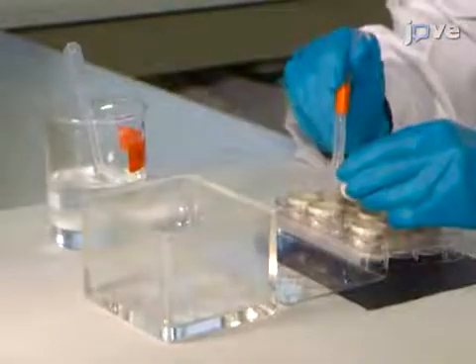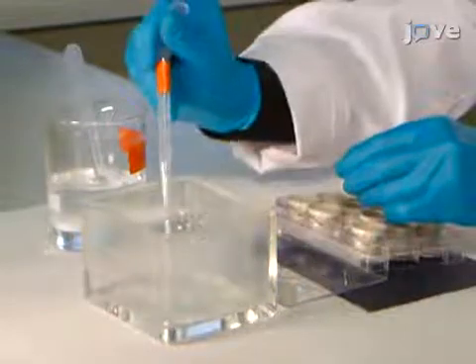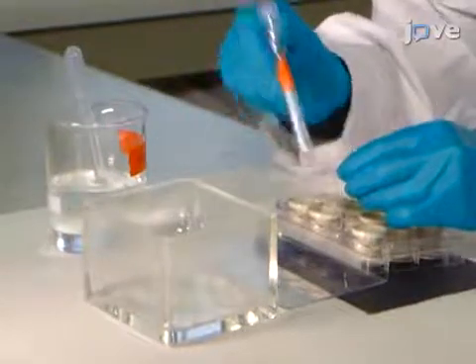Then, wash the sections for 10 minutes with 0.1 molar PBS at room temperature and repeat three times.